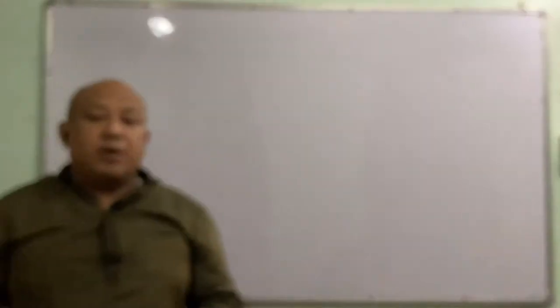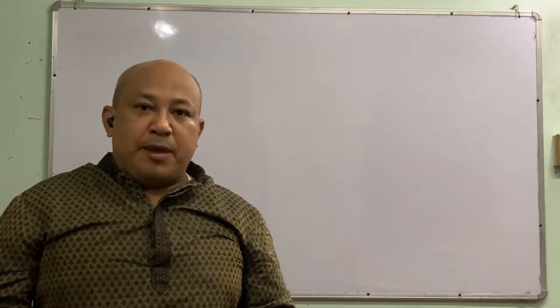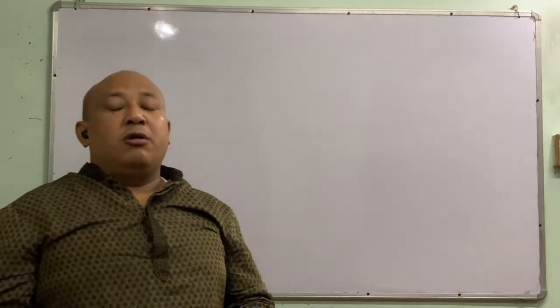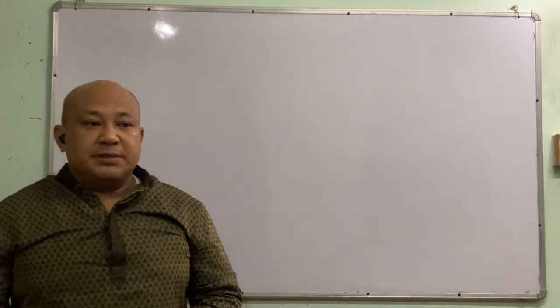Today I will be continuing the practicals of the environmental engineering lab. Last class I covered all the physical parameters. Today I will be continuing with chemical parameters.